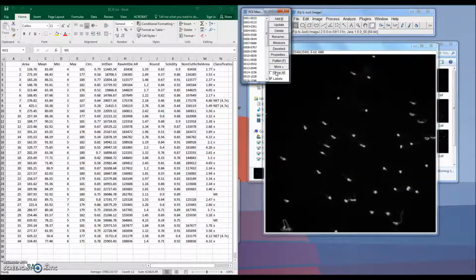It's pretty hard to pick up on some of them, whether it is actually a net or not. It's pretty close, like this one. I think that you could argue for that being a net, but Dana provides a pretty unbiased way to determine and label whether that is a net or not.